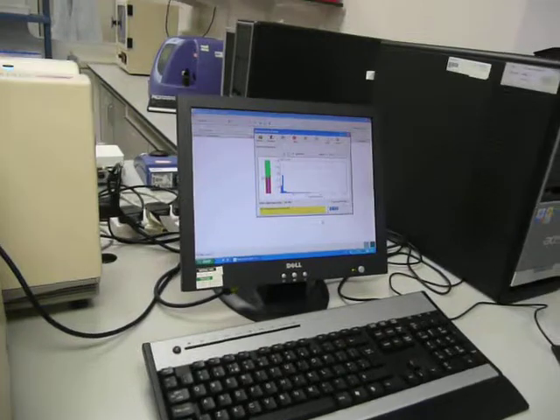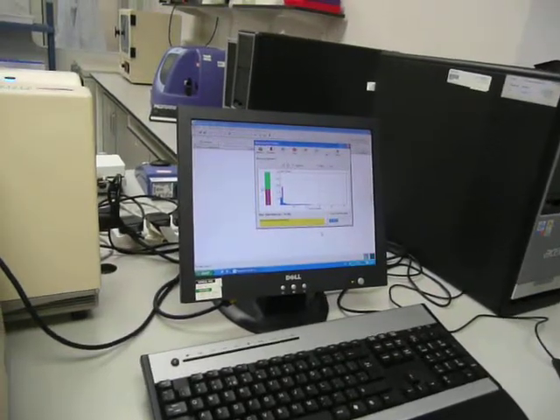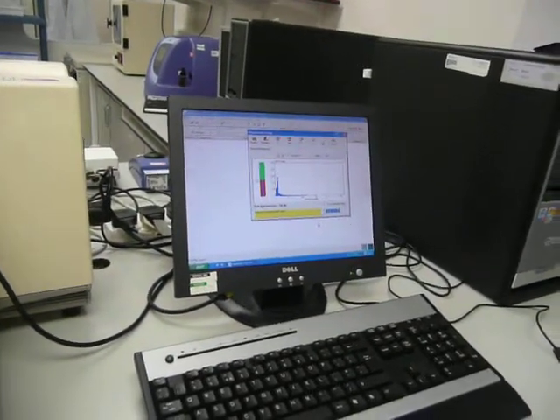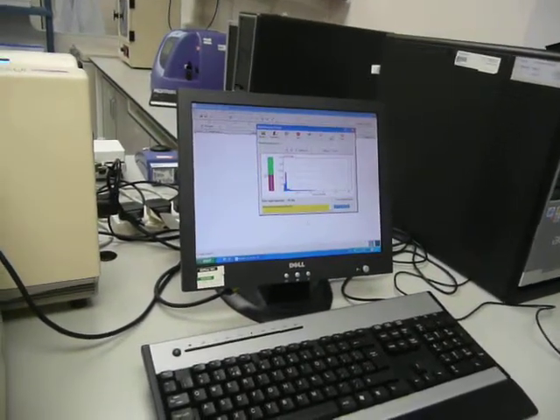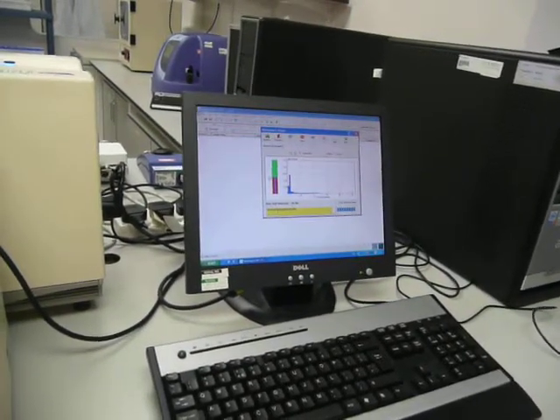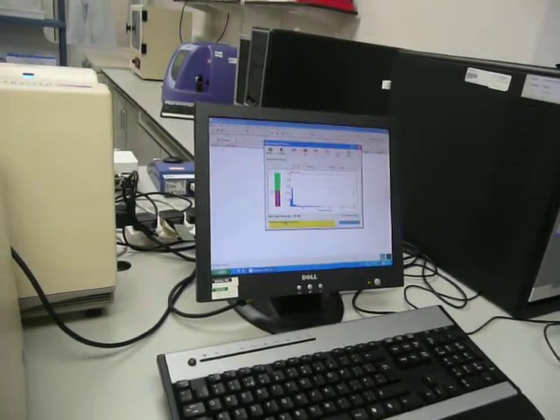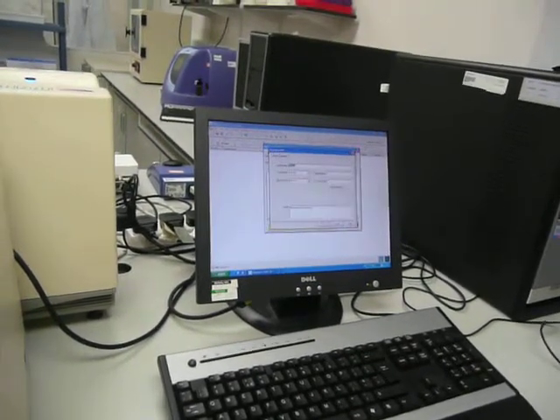You want a low value like that. Really, as a note, you're getting ready because everything, you do a towel from this window.